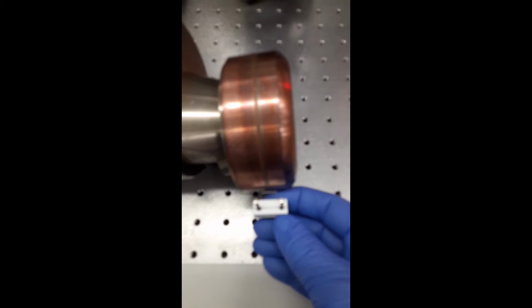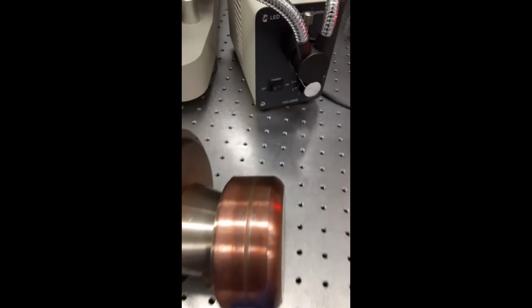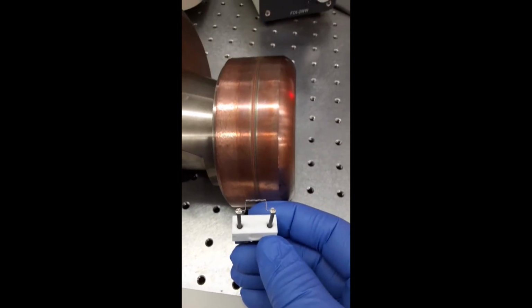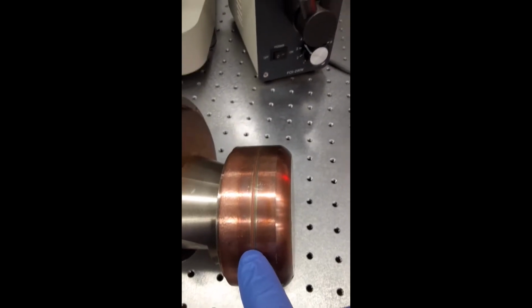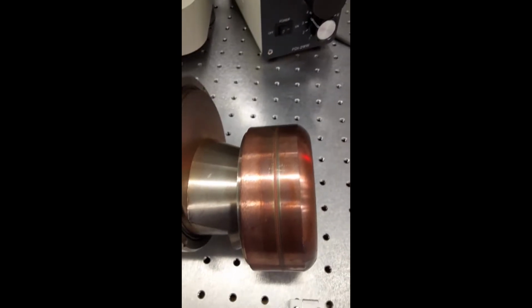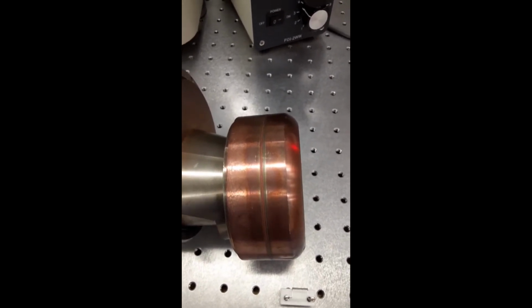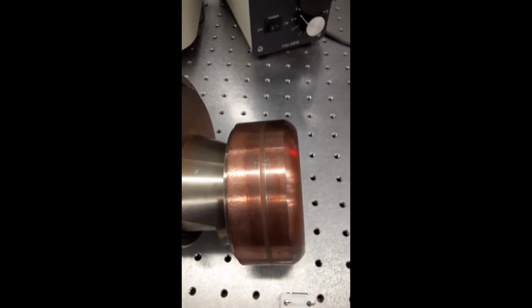So under high vacuum, a stream of electrons, and in our case, it's set to 40 kilovolts, 20 milliamps, flows from the cathode to the anode. And as the electrons strike the anode, when they interact with the copper atoms, an electron is displaced from a low orbital in the copper atom. Then when another electron drops down from a higher orbital to a lower orbital, an X-ray photon is produced.